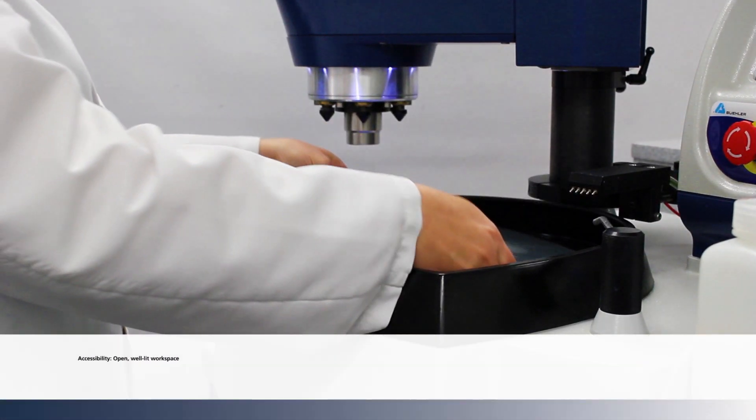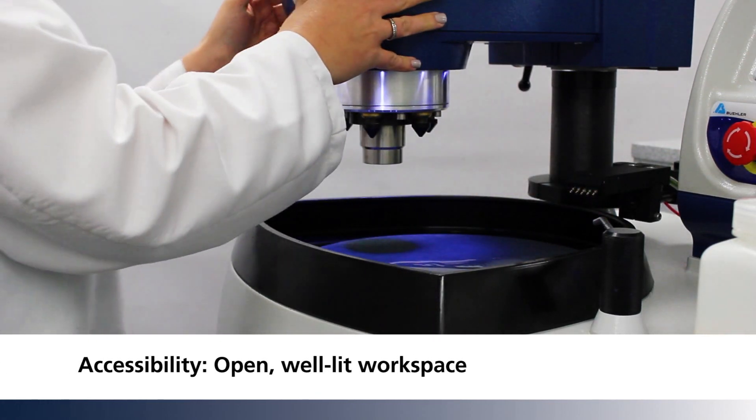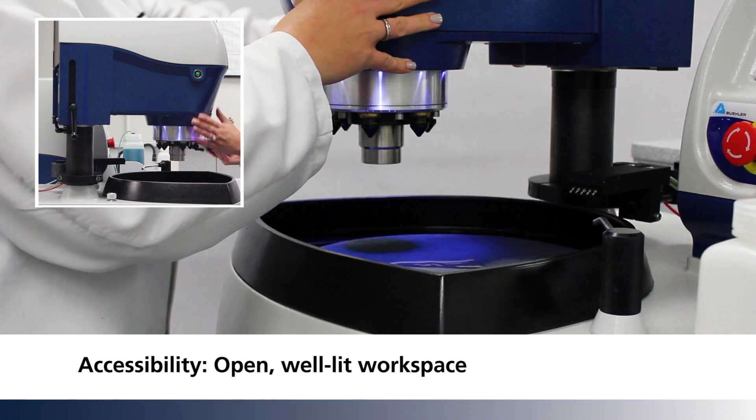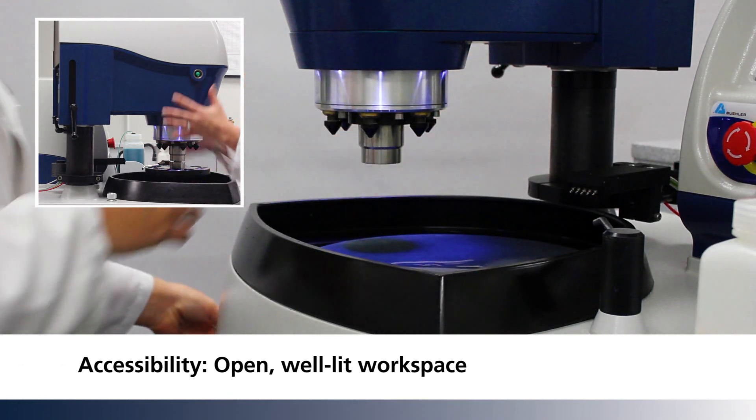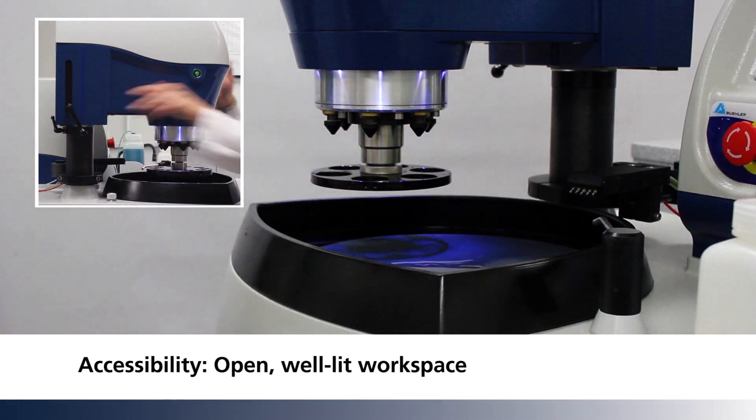With the open D-shaped workspace and LED lighting, specimen holder changes are easily accomplished. The well-lit space also makes it easy to adjust the holder location.